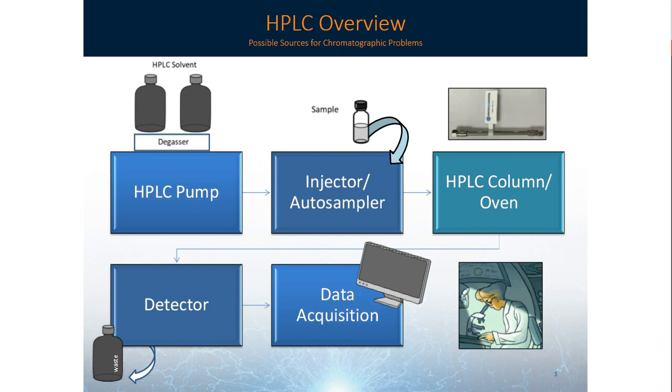So us scientists, whether it's an issue with the sample prep or some issue with mobile phase preparation, can all really lead you to some issues in your analysis.